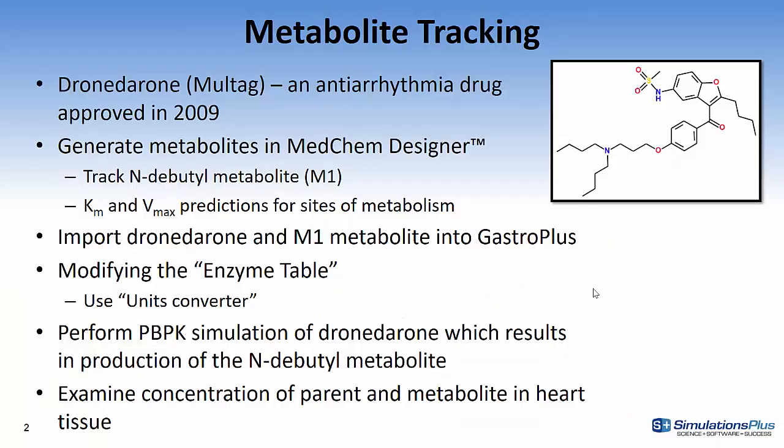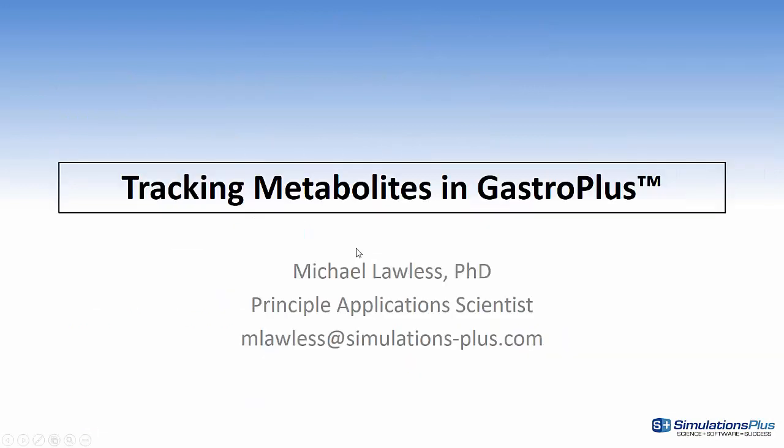So now let's go back to this slide to summarize the steps we performed in this video. We used Dronedarone as an example, generated the metabolites in MedChem Designer, imported the molecule and the M1 metabolite into GastroPlus. We modified the enzyme table to show the appearance of the M1 metabolite, performed the PBPK simulation which resulted in the production of the N-debutyl metabolite and then we examined the concentration of the parent and metabolite in heart tissue.